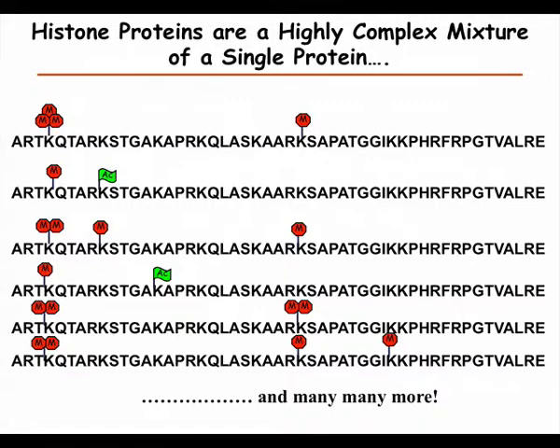Where you do some enzyme cleavage but use bigger pieces, it's called middle down. Not top down, because it's not the whole thing, but it's a big piece.